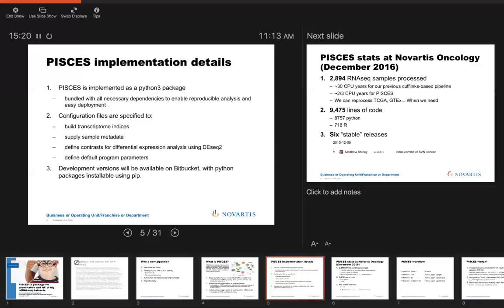Pragmatically, we sort of dumped that early on, and now downsample the FASTQ files to approximately 100,000 reads and perform a Bowtie 2 alignment. That still takes less than 10 minutes per sample, and it gives us enough information to quantify the amount of ribosomal RNA, the amount of intronic sort of genomic contamination, mitochondrial DNA, all of that. Do you calculate duplication rate? Duplication rate's problematic if you downsample your number of reads. So I do calculate it. It's not reliable.